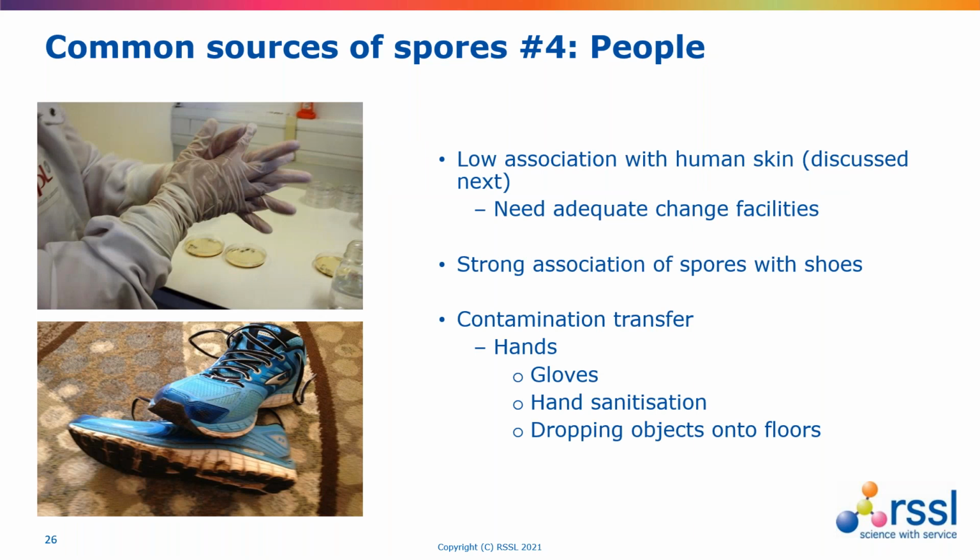Now, people in general don't carry high numbers of spores, but there are risks of transient flora, particularly from outdoor clothing and especially from shoes. So the general good cleanroom practices of effective gowning, using gowns of appropriate quality, frequent glove changes are all important, as is glove spraying. So although glove sprays are not sporicidal, the regular activity of hand disinfection keeps overall microbial levels low.